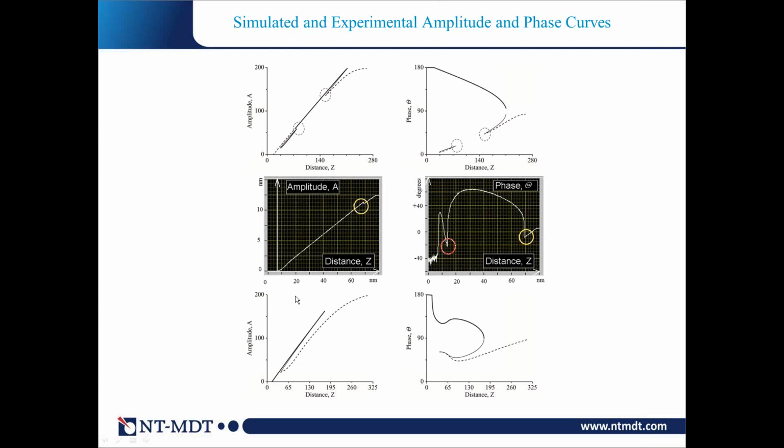another. And the situation doesn't change much, it looks quite similar, if you include even dissipation, as in the case shown at the bottom. But the practical curves, which you see in the middle, also show that the data go more or less along these theoretical predictions: we have the drop of the amplitude with the kink here, where the possible transfer between two branches happens. And if you measure this kink with your images, you sometimes see the amplitude jump.